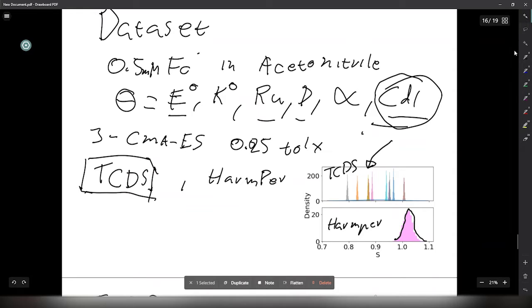setting, say, alpha as 0.5, or setting diffusion to an experimental value. Two very common ones. You can also set K AA, capacitance, E0, just change whatever.